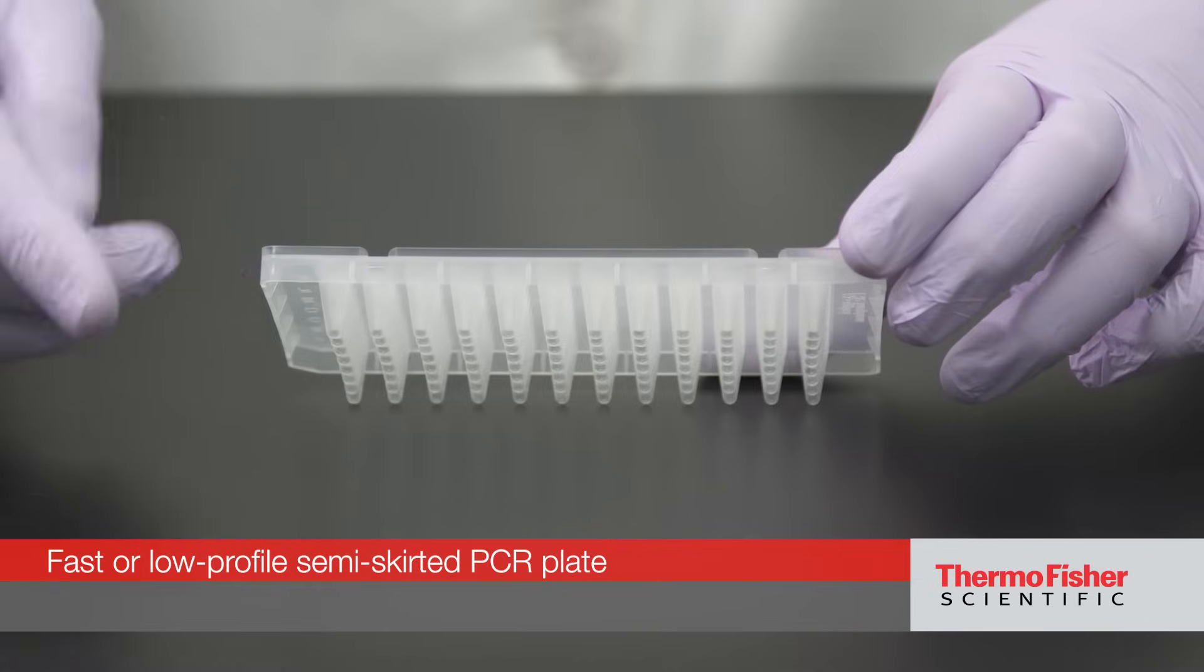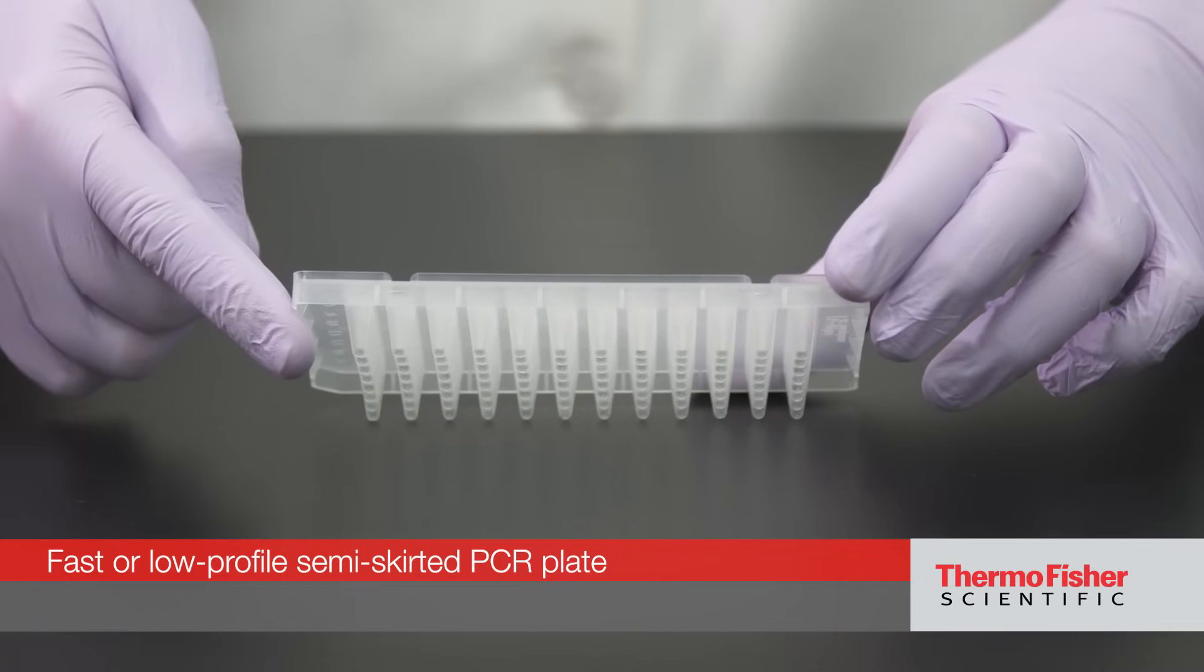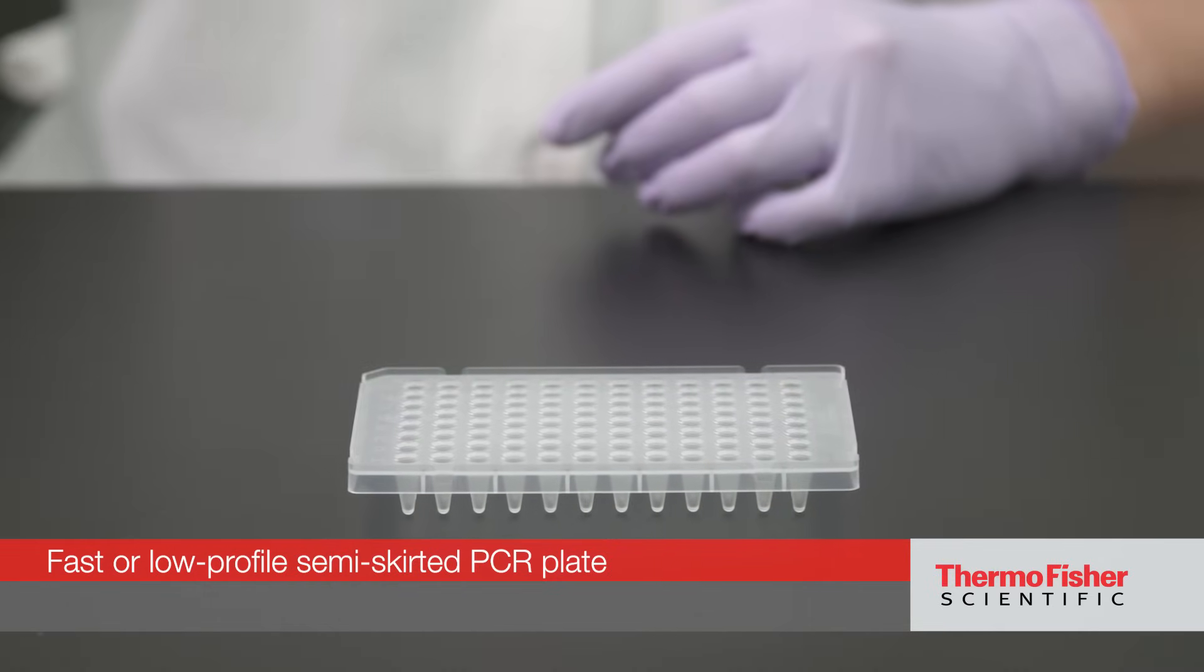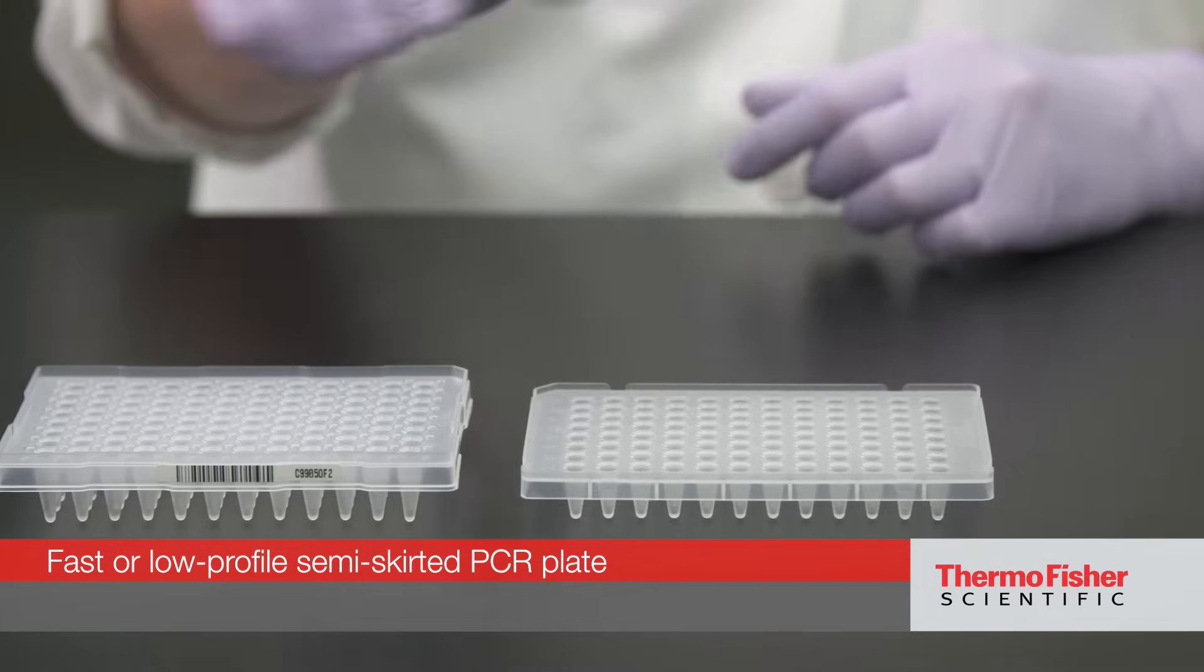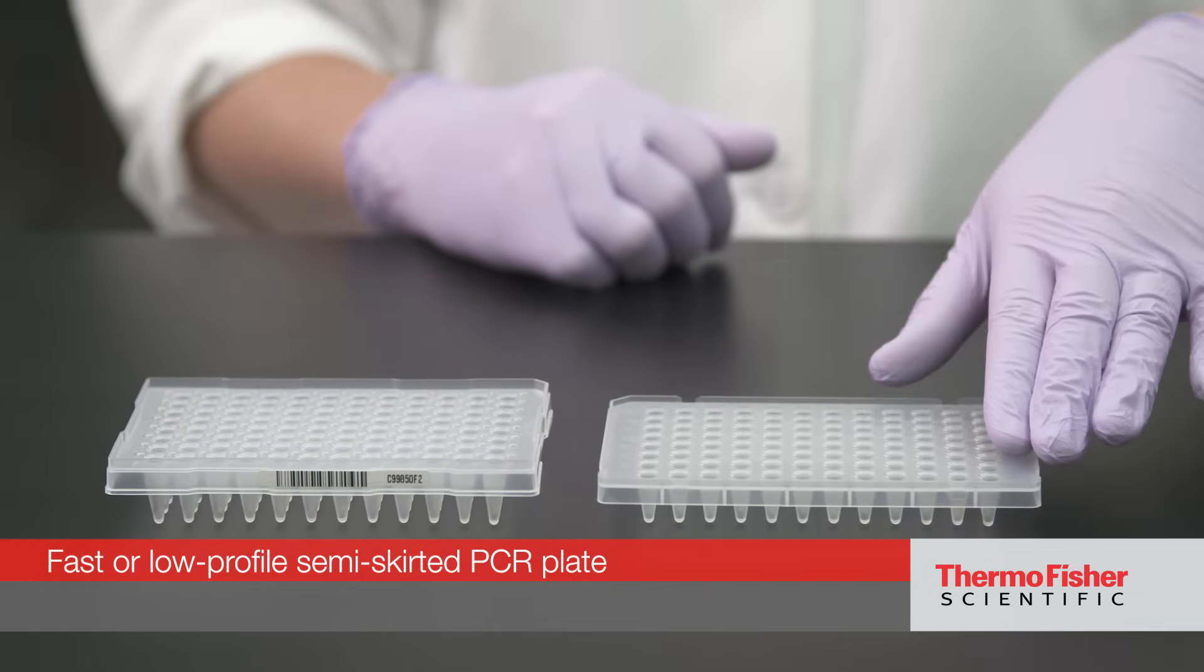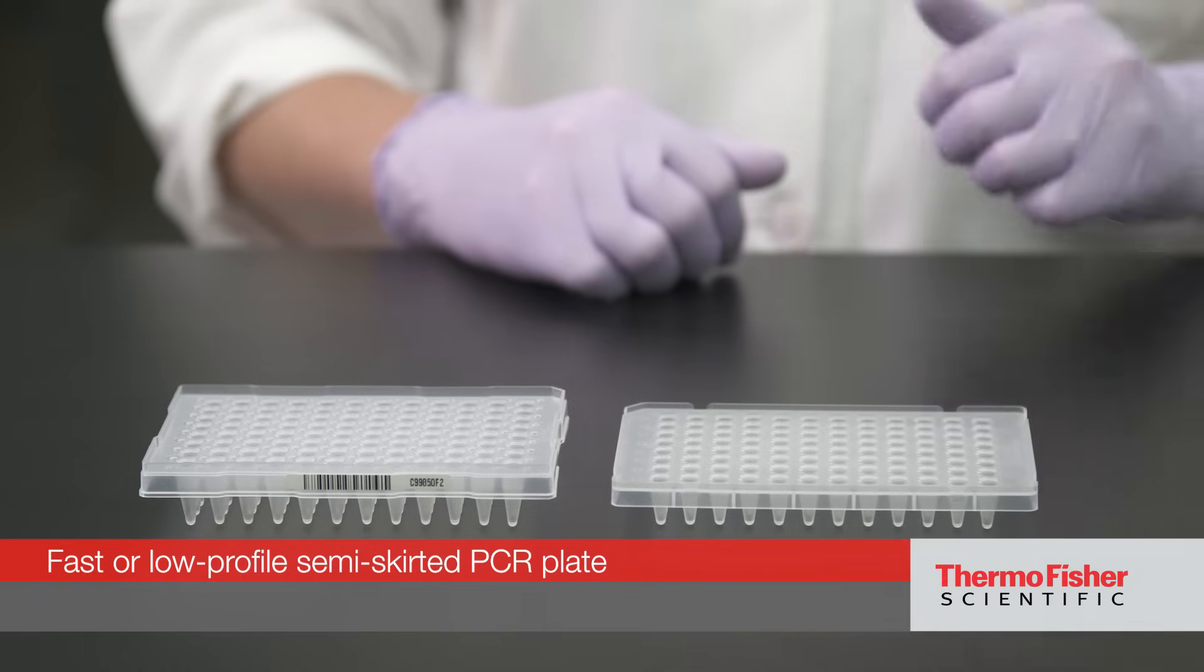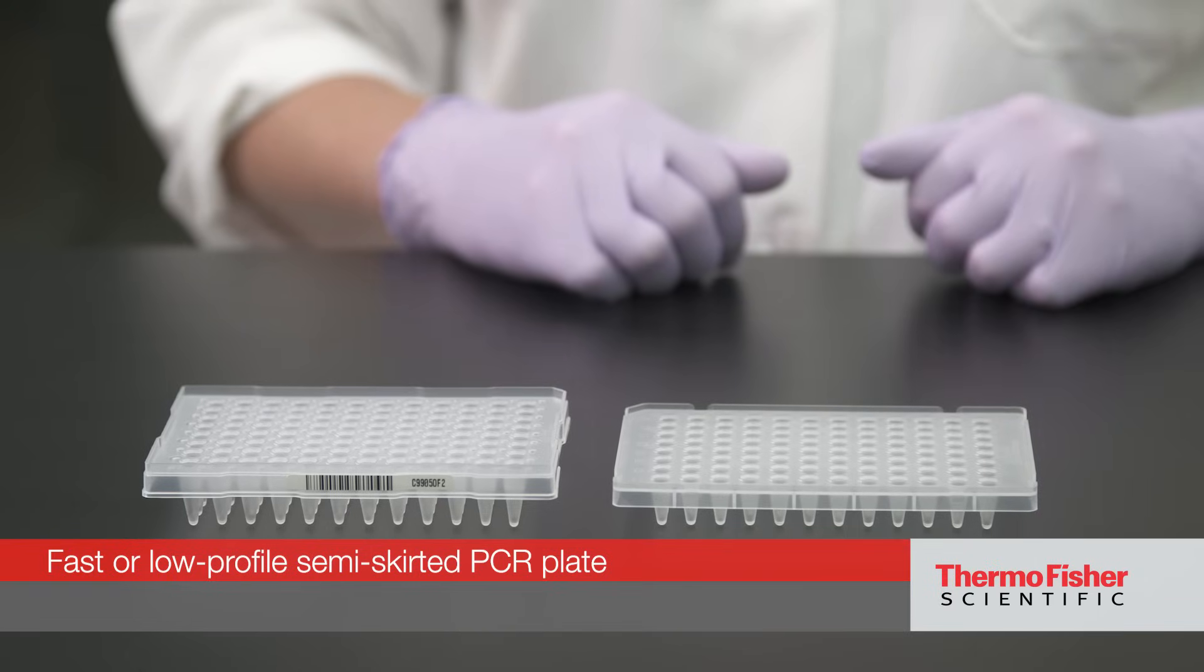Fast or low profile PCR plates are designed with smaller volume capability. Therefore, well height is shorter when compared to a standard 96 well plate. These plates are required for fast or low profile thermal cycler blocks.